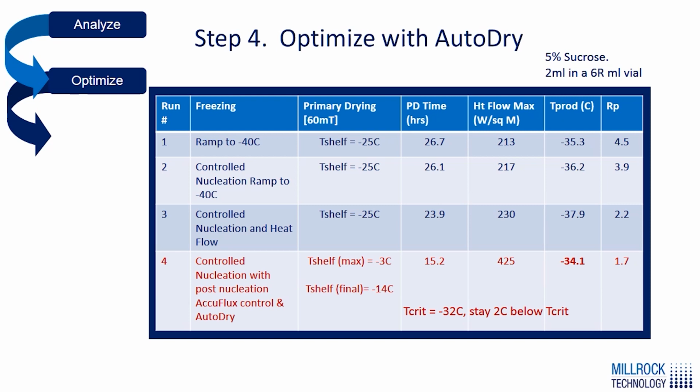The results we see from this are that our primary drying time has been reduced to 15.2 hours, so a pretty significant reduction in primary drying time.